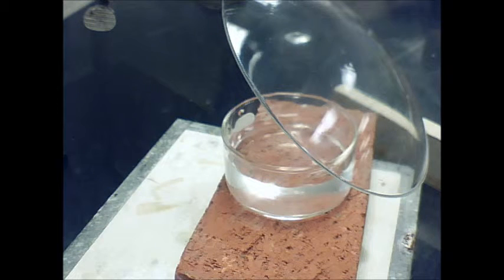Everybody write down what they saw. Got observations written down on what happens when you put pure sodium metal in water.